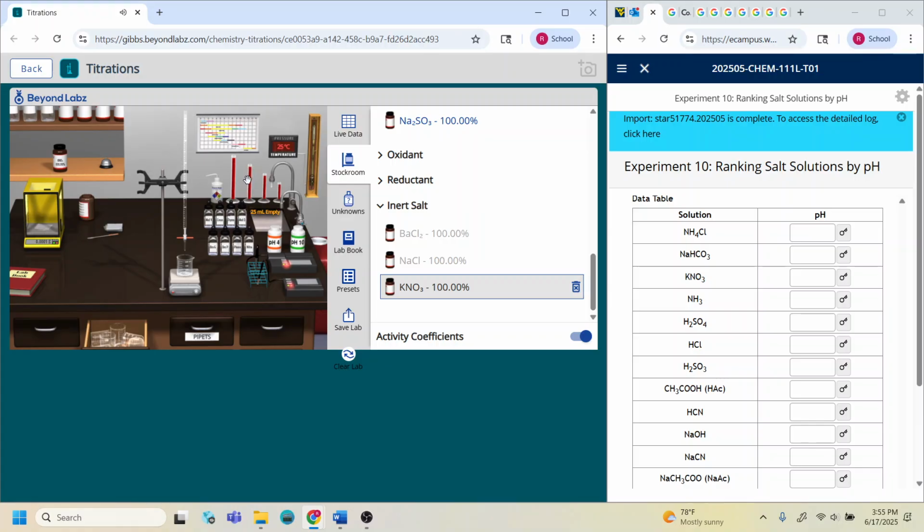We're going to grab a 25 ml graduated cylinder. Make sure, guys, that it's empty. It says that it's empty first. We're going to put it under the water, and this has to be completely filled. See, right now it says it's partially filled, so you have to completely fill it. Right now it's completely full, so we're going to go ahead and dump the 25 ml.